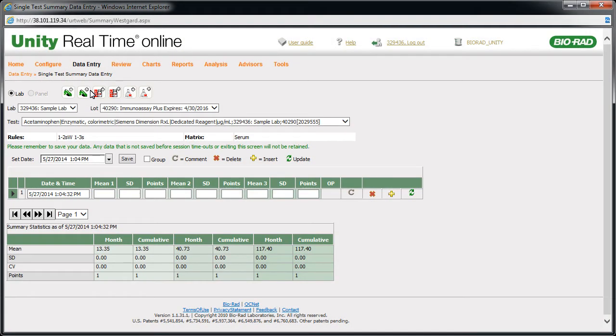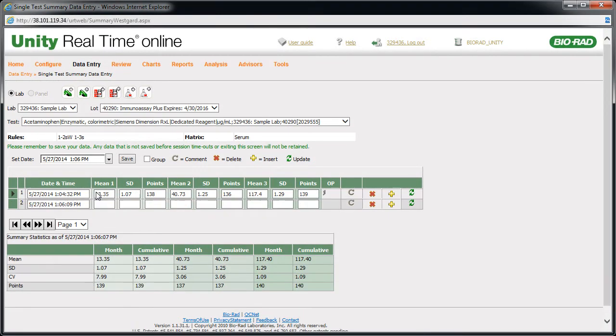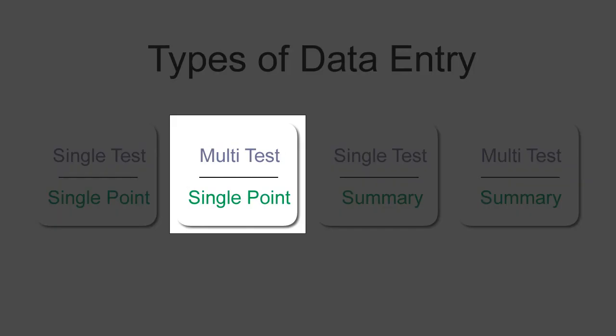Select the date. Then enter the mean, SD, and number of points. After entering all of your data, click Save. Now we'll take a look at entering single point data for multiple tests at the same time.